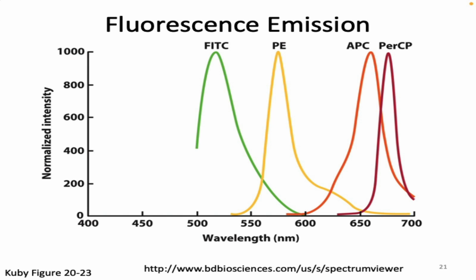The cytometer that I have does not do 4 colors. It's slightly less than 4 colors. The most complicated cytometer that I've ever used was a 19 color.